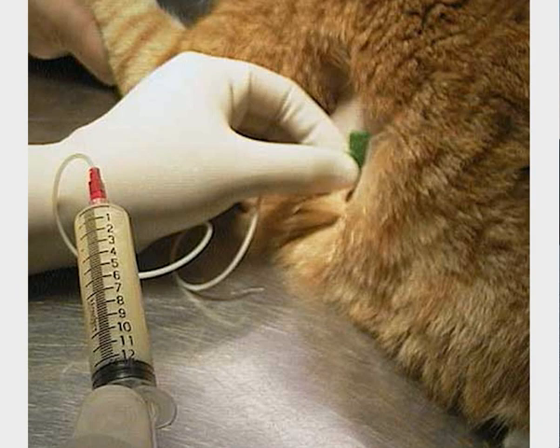So the first thing is collection. We're probably going to be talking a lot about abdominal and thoracic collection of abnormal fluids, although they can occur anywhere in joints, even CSF fluid and transtracheal washes can still use all the same prep procedures that we're going to do for the effusions that we're going to talk about here.